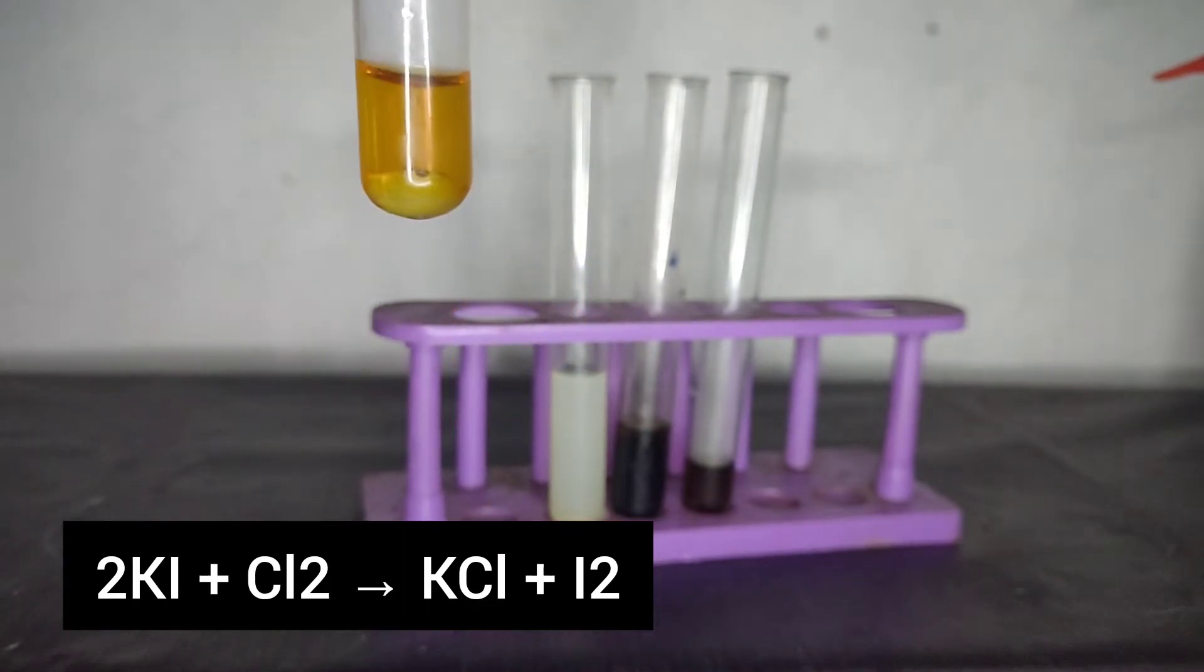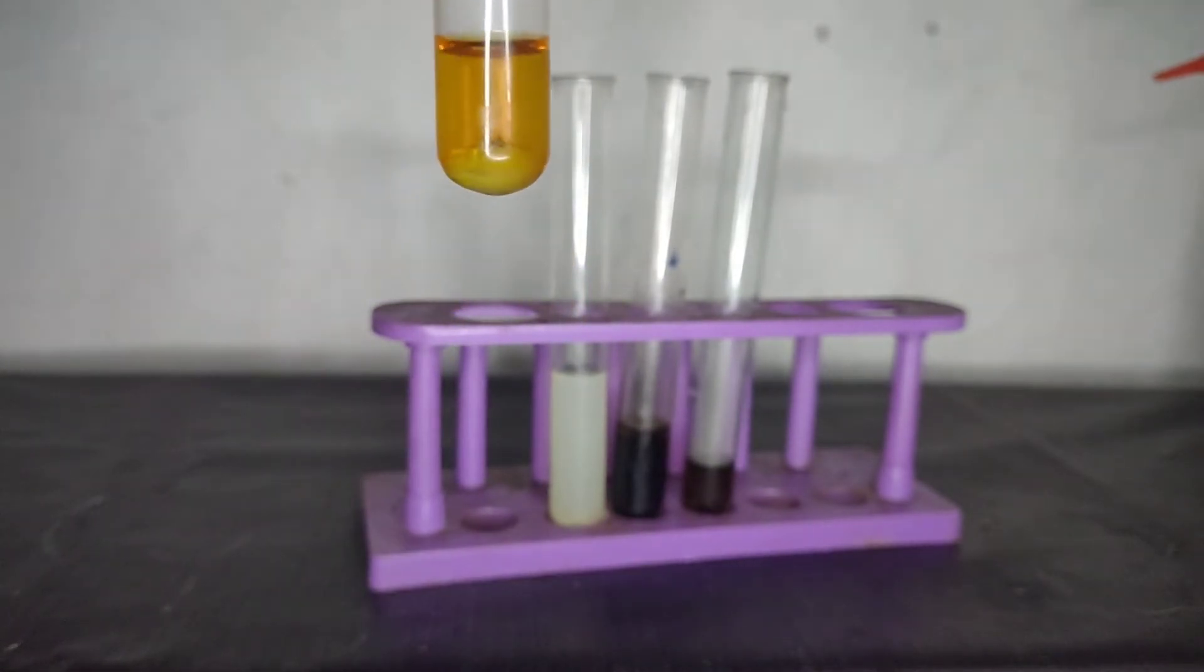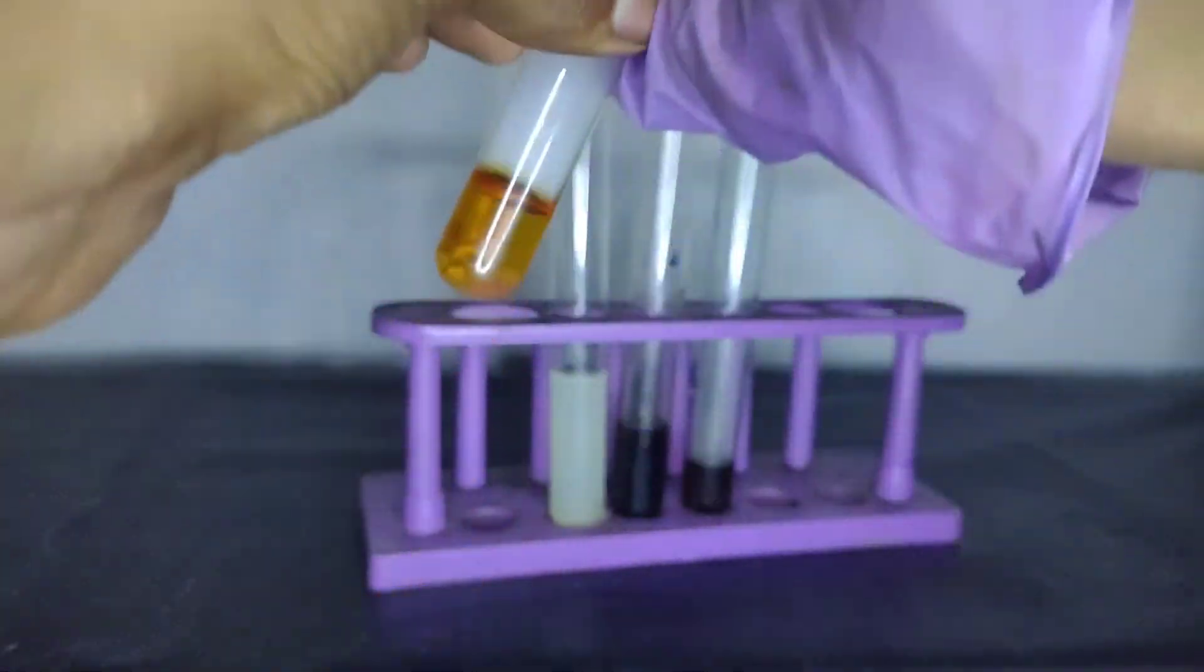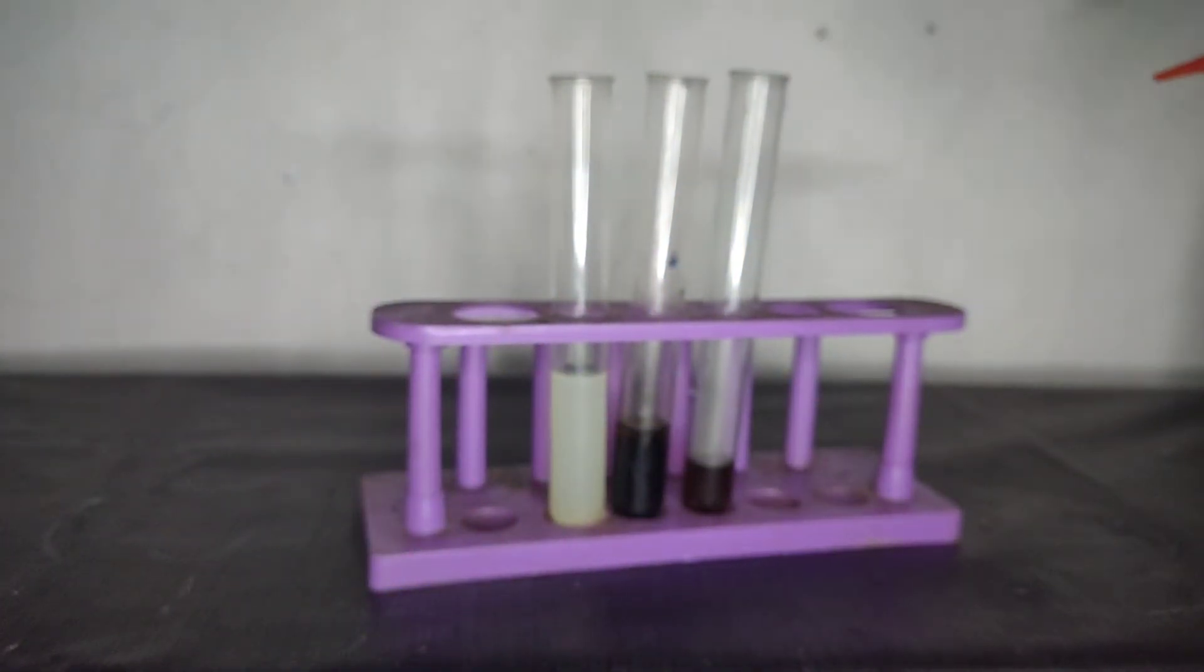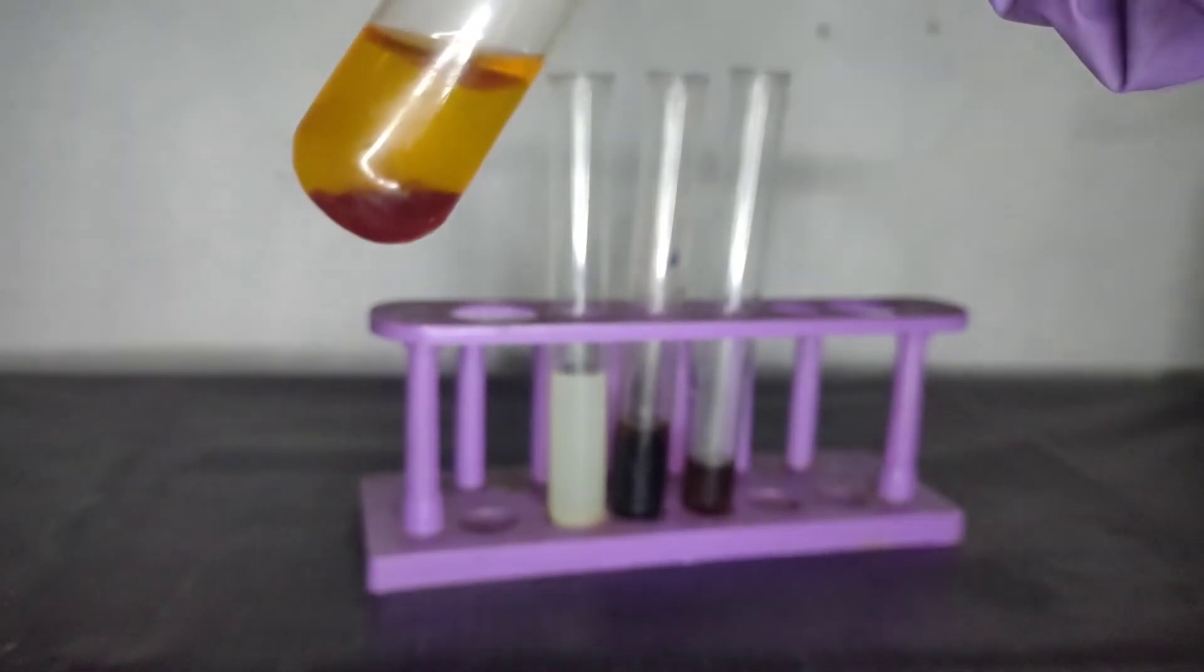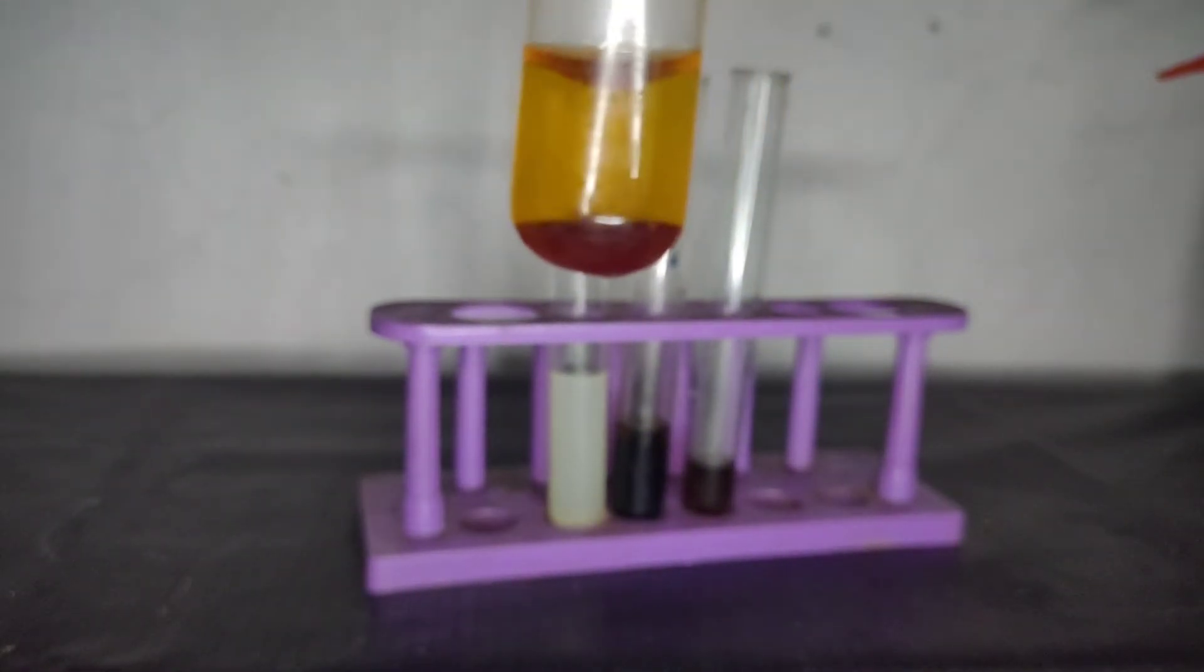You can see that on adding chlorine water the solution acquires a brown color. Now just put your thumb at the mouth of the test tube and give it a vigorous shake. You can see that the color of the organic layer that was chloroform is now violet in color.